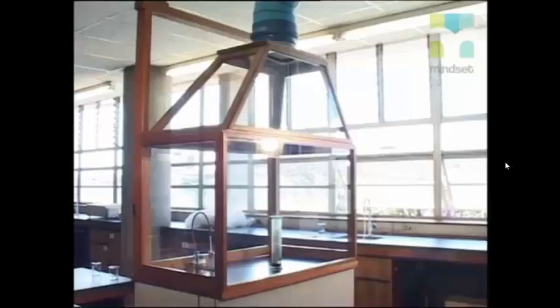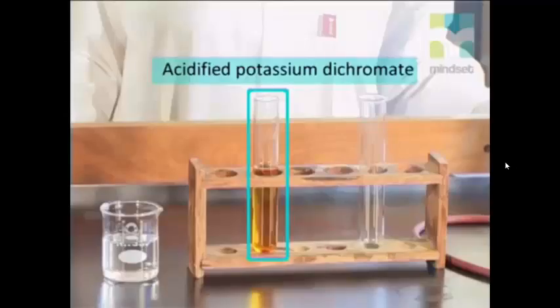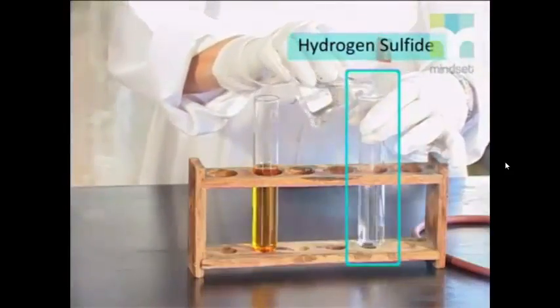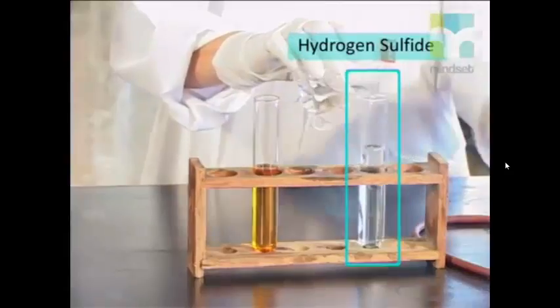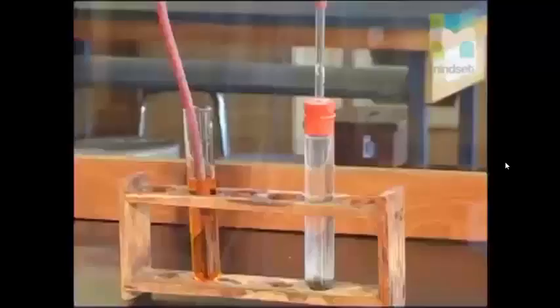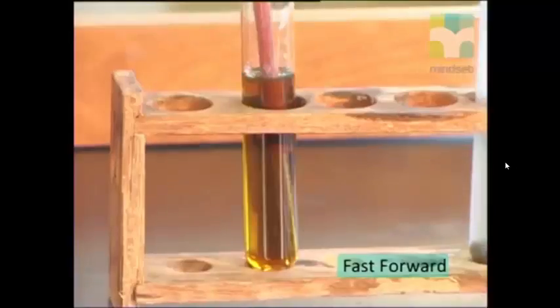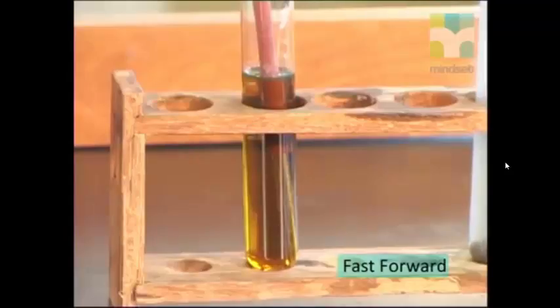Please note that this experiment must be carried out in a fume cupboard. Hydrogen sulfide has a horrible rotten egg smell and is also very toxic. Note the acidified potassium dichromate color. It's orange. Acidified means that we have added some acid to the potassium dichromate. We now add the hydrogen sulfide to the acidified potassium dichromate. Can you see any changes? We see that the orange color has turned greenish brown.